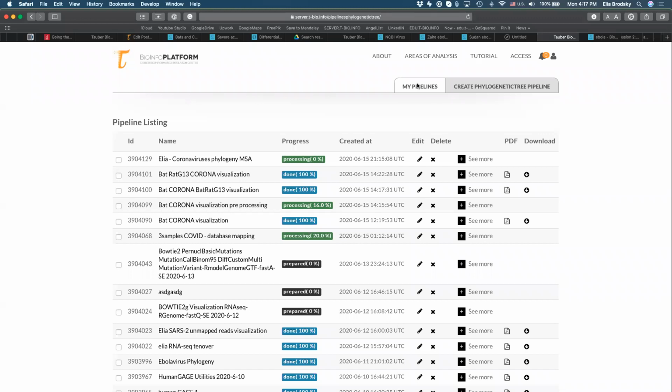Your speaker broke up after I finished talking, so I'm not really sure what you said. I'm just saying that it's important between now and the next time to be able to complete one of these pipelines and get the output, so that for the next sessions we'll actually go into the different types of outputs that these pipelines have. And so I was just asking if everyone that's here on this session was able to actually start this pipeline.